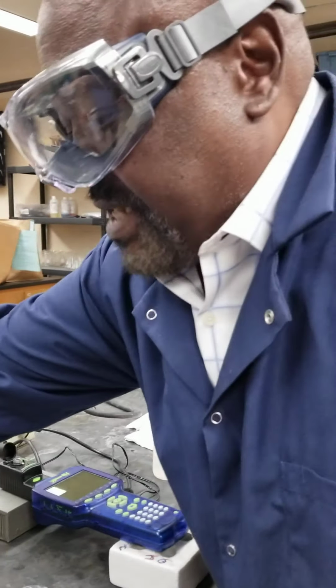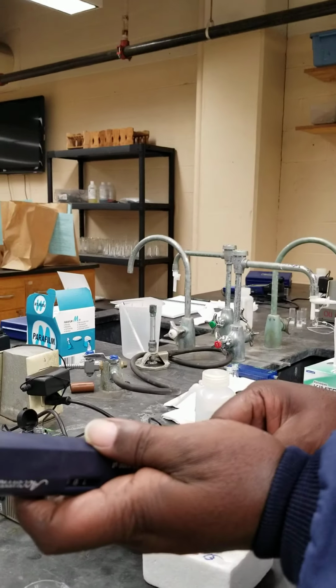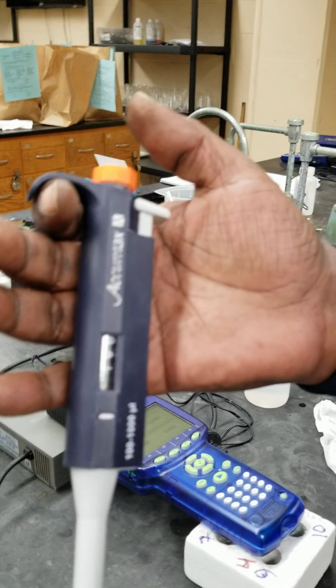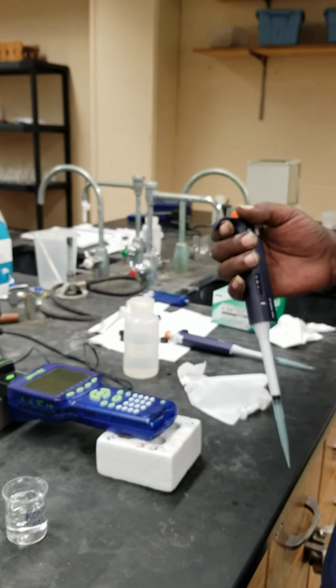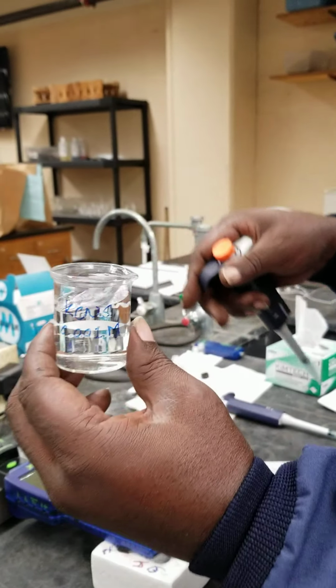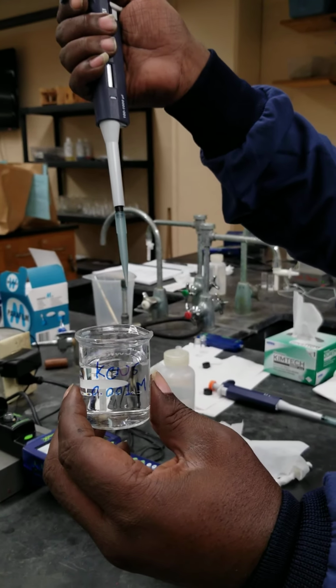That is now set at 0.1. So I'm going to be adding 0.100 milliliters of the potassium thiocyanate. There you are, potassium thiocyanate. Let's add it. That's a small volume.